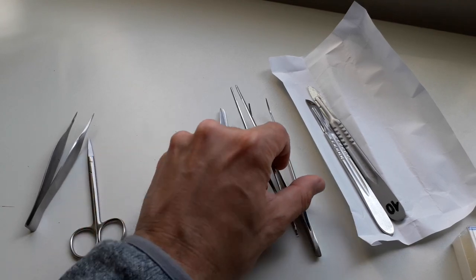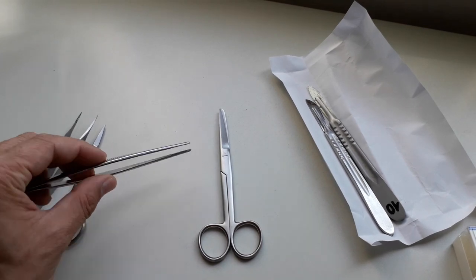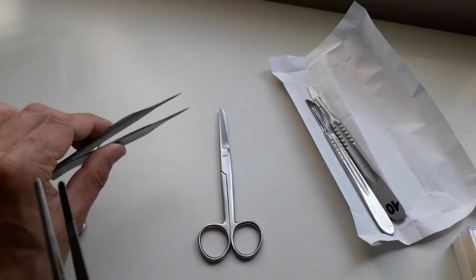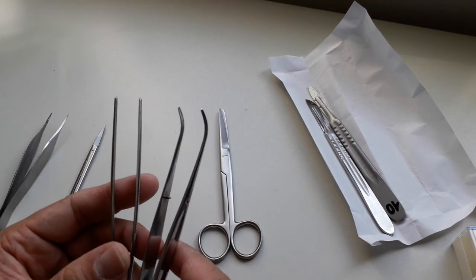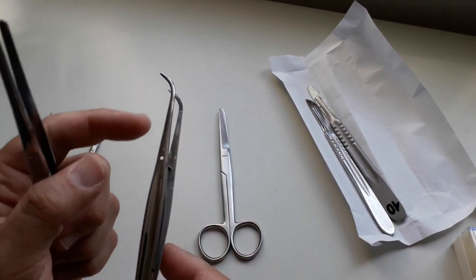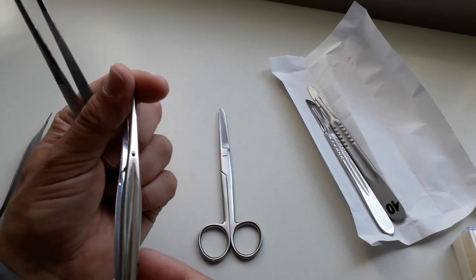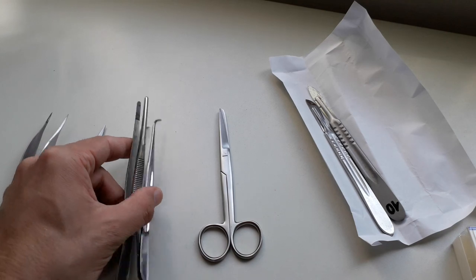These other tweezers I use less often, maybe for positioning the cover glass on the slide, but for that I could also theoretically use this one here. I'm not using them so often, but they're occasionally useful. I would not get both of them. One of those two would be enough. There is really no point for it to be at a 45 degree angle here. I use them basically for the same purposes.